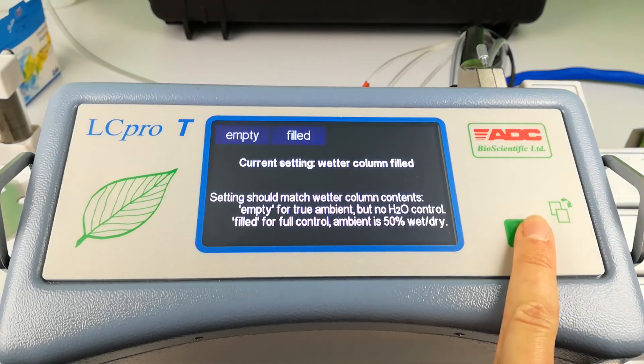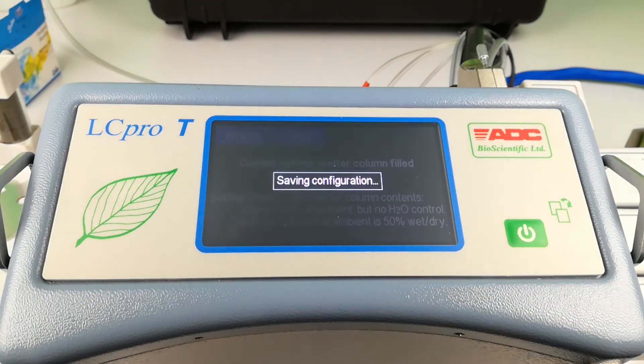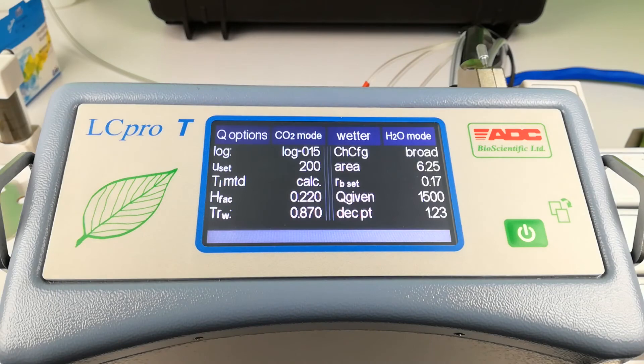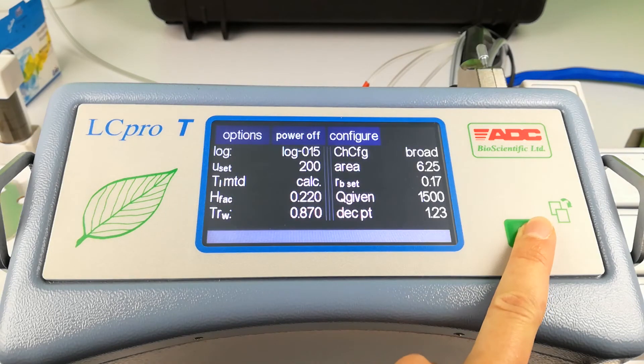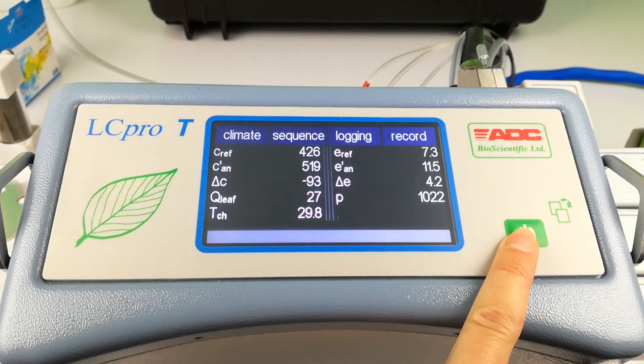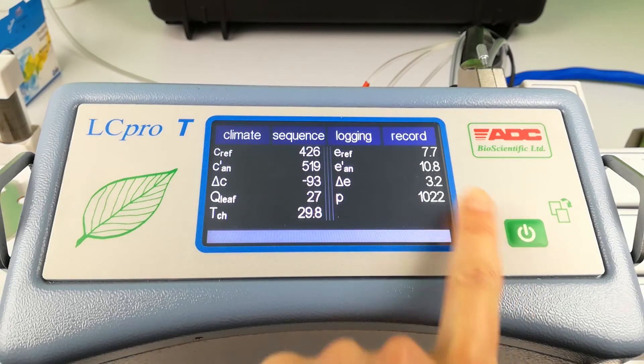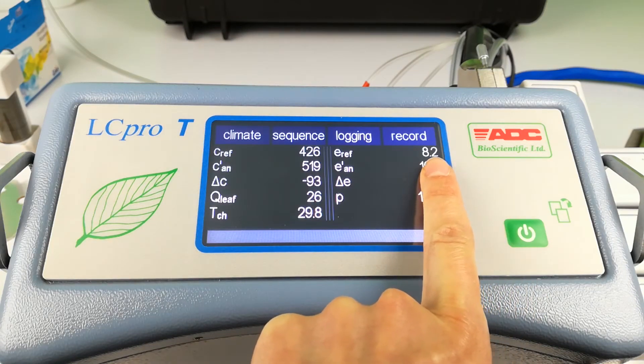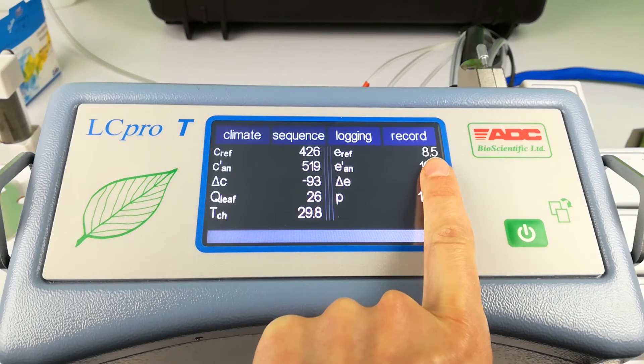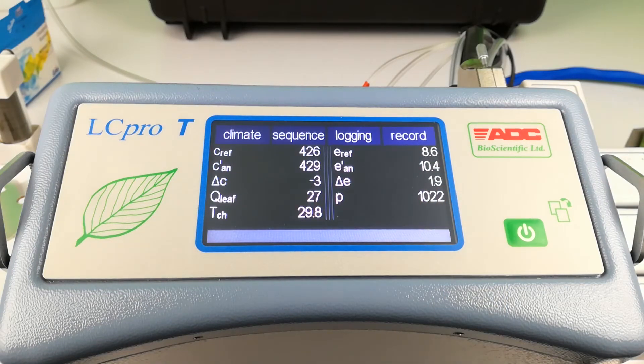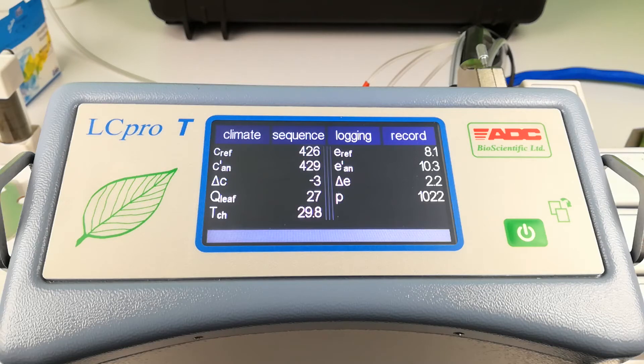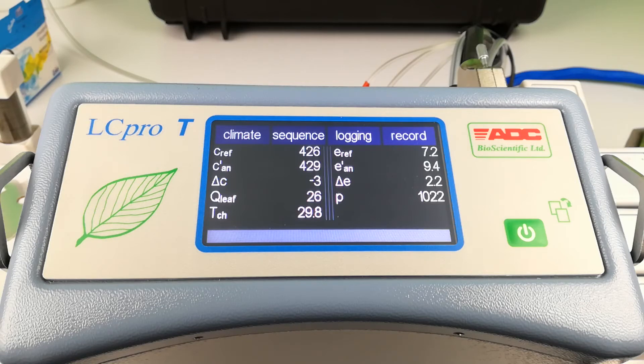Exit this menu and here you can see the E reference value changing to the set value. This is given in millibar. Once your set value has been achieved, the LC-PRO-T is ready to control the chamber at your desired H2O value.